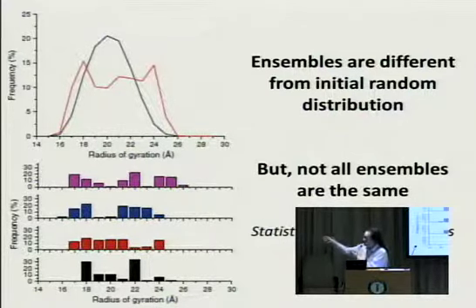So it's true that overall you get a tendency, but the individual ensembles can actually differ a little bit. And this, in our opinion, warrants that one should not look only at one ensemble or a limited number of ensembles, but you actually do need to have a large number of alternative options and then compute averages from those. So it's kind of averaging the averages.